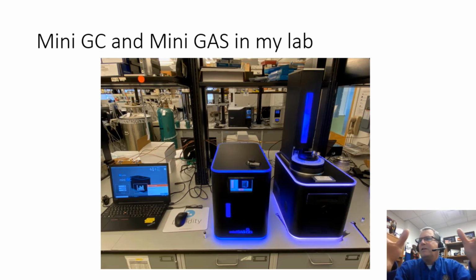So you can see a little bit of the compare and contrast when we think about greenness and what you want to do. I think in method development, spend a lot of time thinking about your method goals. How do those method goals match up with the instrumentation you're looking at? There are certain things I need to do on that GC times GC TOF, but not everything. And that's something I want to think about.